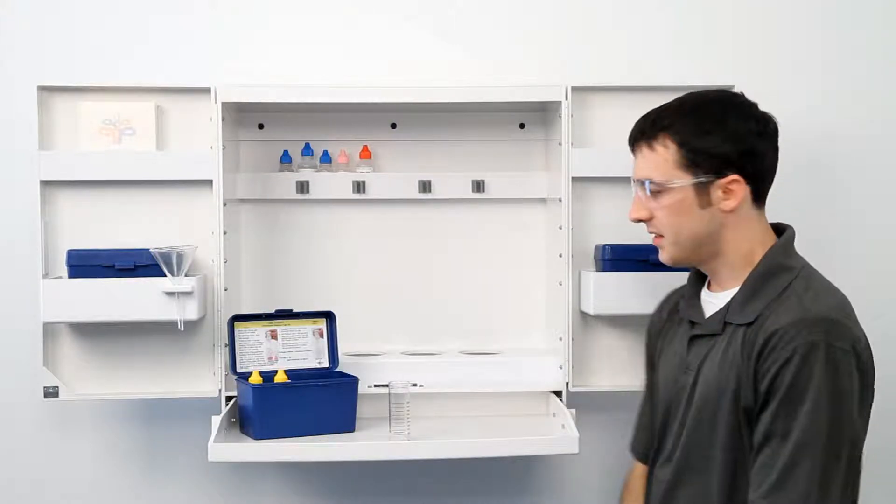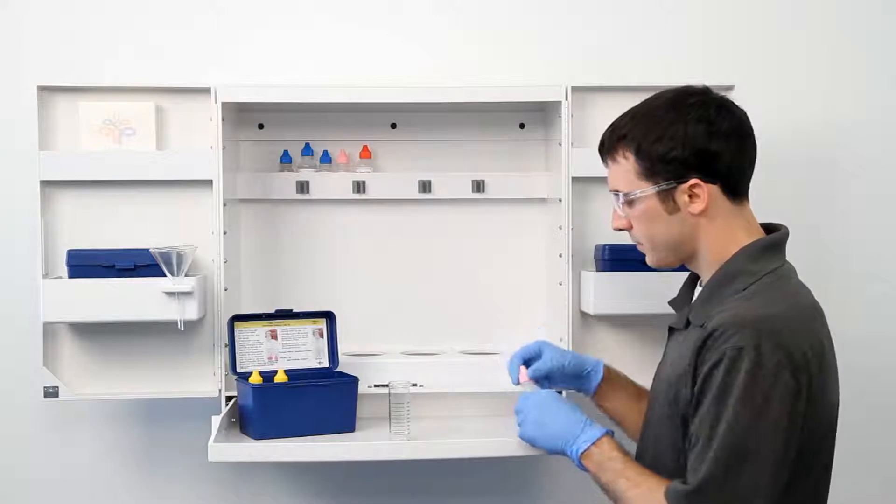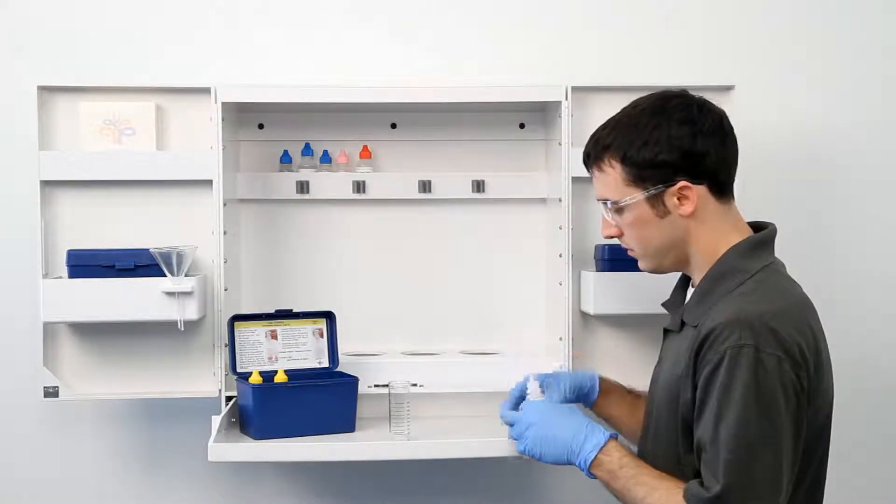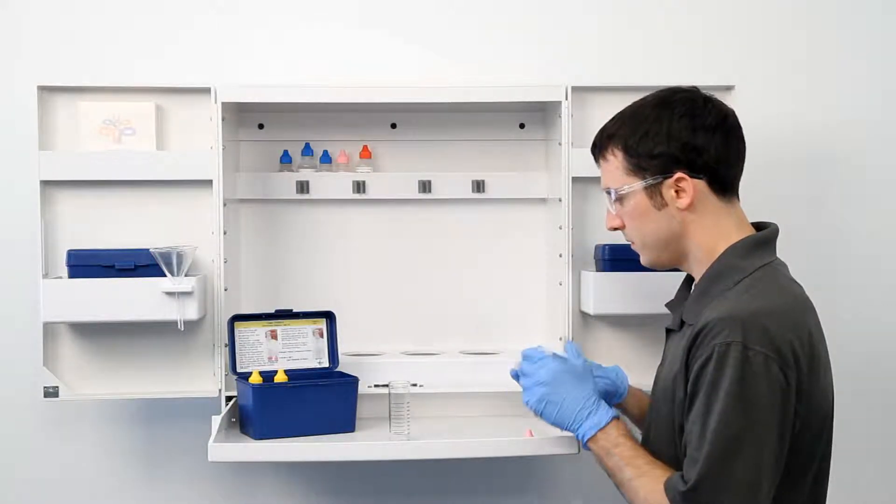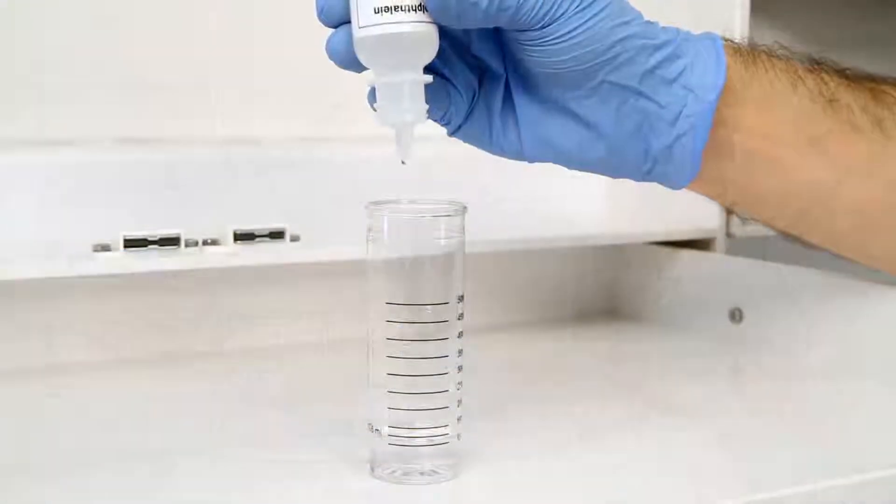Once you have gathered an accurate sample, the next step according to the Endpoint ID procedure is to add three drops of phenylphthalein indicator. The bottle contains a dropper tip, so it's important to hold the bottle vertically to get a consistent drop size.